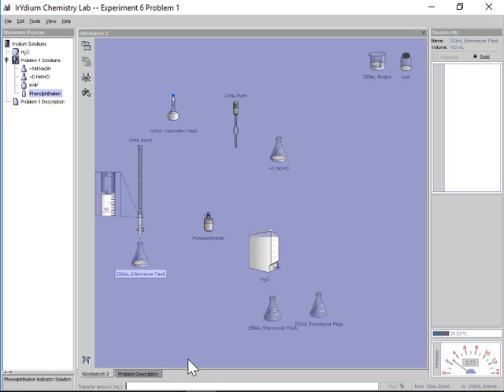I can wash down. I should be really, really close now. I haven't even been counting how much 0.05. That's okay because I'm going to take a reading later on. So I'm just going to pour. We're waiting for this to turn pink. So we had NaOH here in the burette.